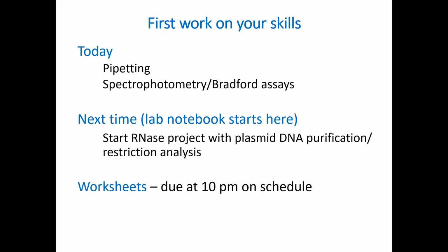Today, we're first going to work on your skills. A lot of people have been pipetting in research labs, and a lot of the time, they're very good at it. Some people don't really know how to pipette, and other people think they're good at pipetting and then find out they're not really good. Pipetting well is the one thing you can do best to get out of here quickly. If your experiments work the first time, then you can show us your data and leave. If not, we'll make you stay till the whole 3 hours is up, repeating it until you get good data. We'll also work on spectrophotometry using Bradford assays.